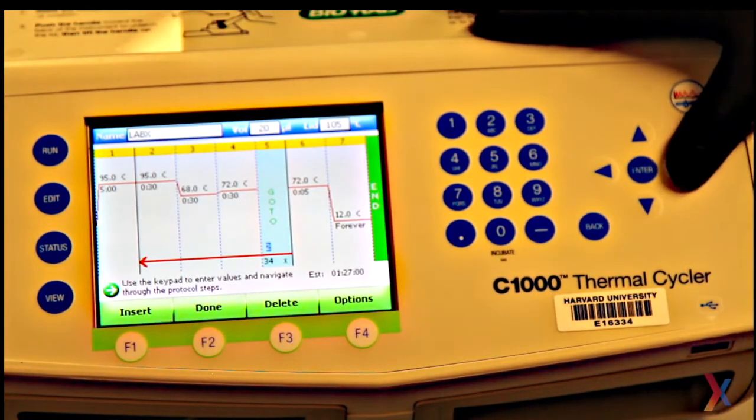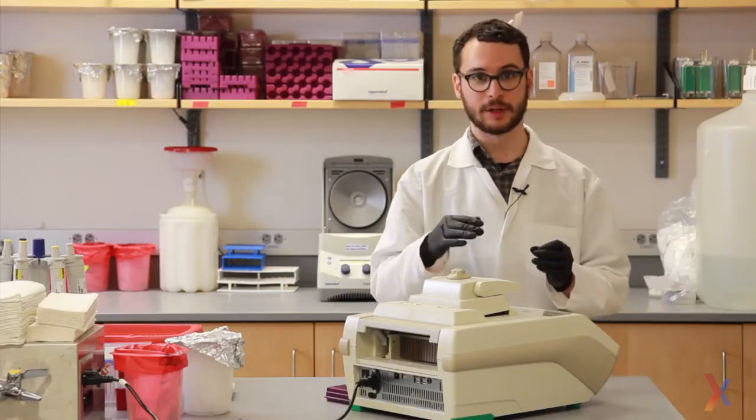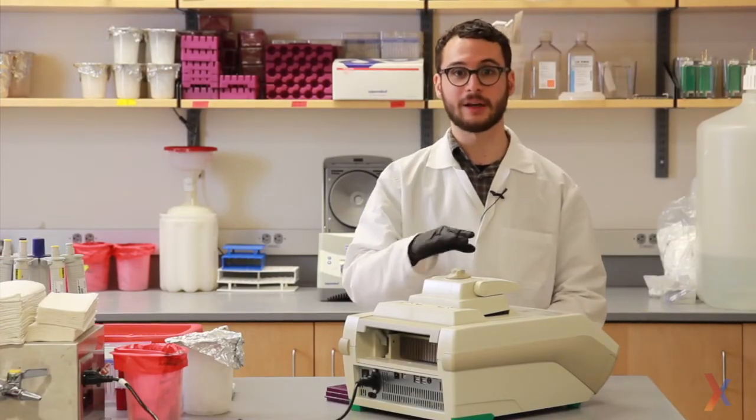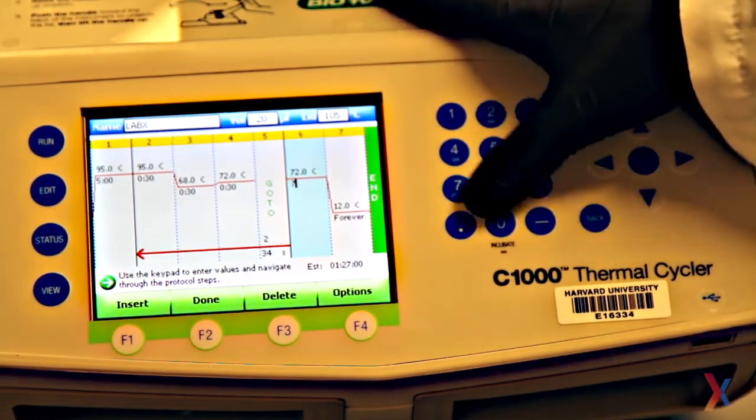When the cycle is over, I'll do a final extension step so that DNA polymerase has an opportunity to finish up any copies that weren't completed. So I want this at 72 Celsius for seven minutes.